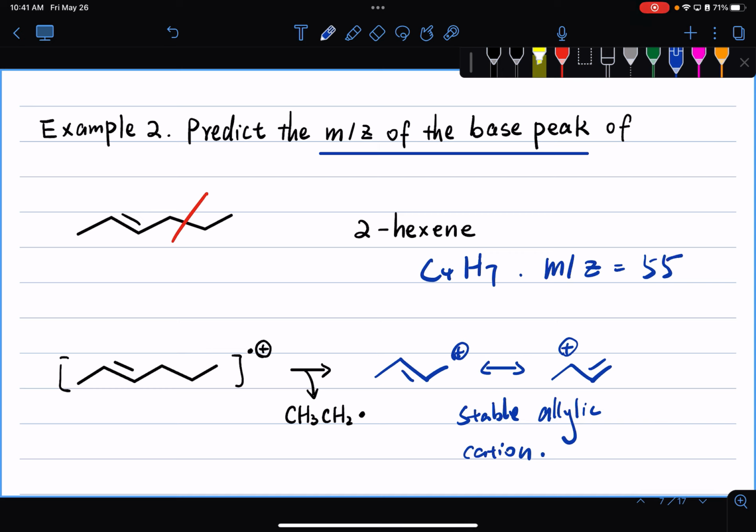So when encountering this kind of question, when we're asking you to predict the m/z of the base peak, essentially what we're asking is at which position you can cleave that carbon-carbon bond to form a stable carbocation. Whether that carbocation is favored by delocalization, by tertiary versus secondary or primary, or by alpha cleavage or dehydration. But I won't ask you the relative peak of dehydration and alpha cleavage. That really varies. Question?